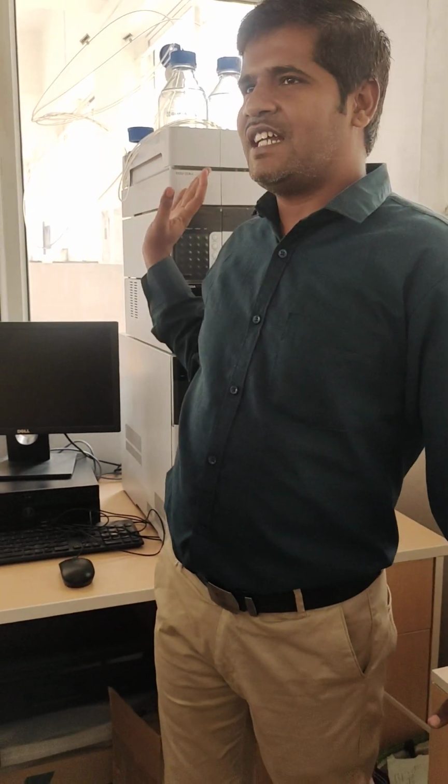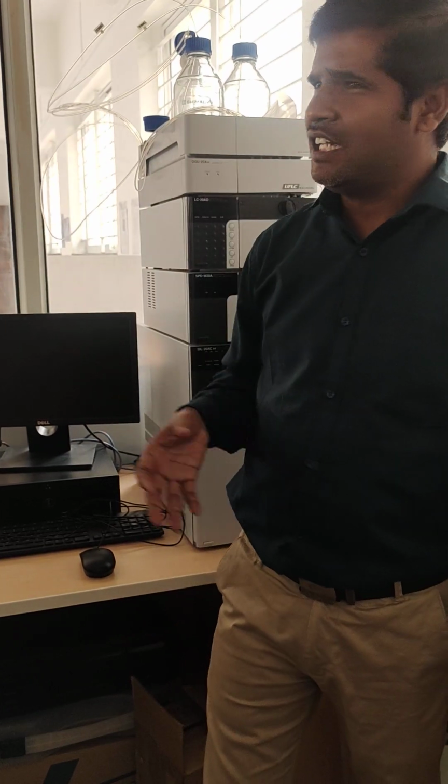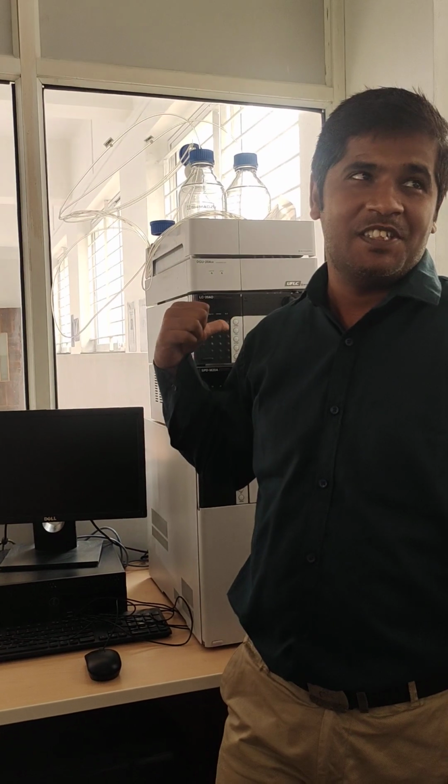Okay, so these are the limitless uses. We can tell a number of uses. We can check the soil content, and we can also check the mineral content in the water. So many uses are there. But we have to know how we perform analysis with the help of HPLC. What is the instrumentation part and what is the principle? That point we have to know.